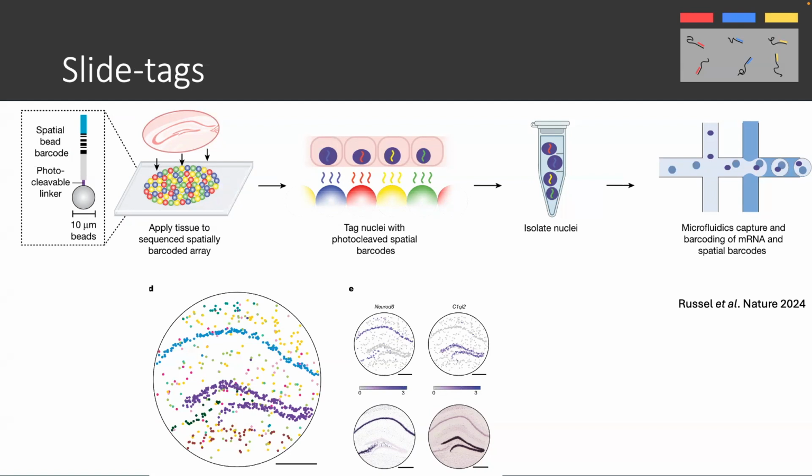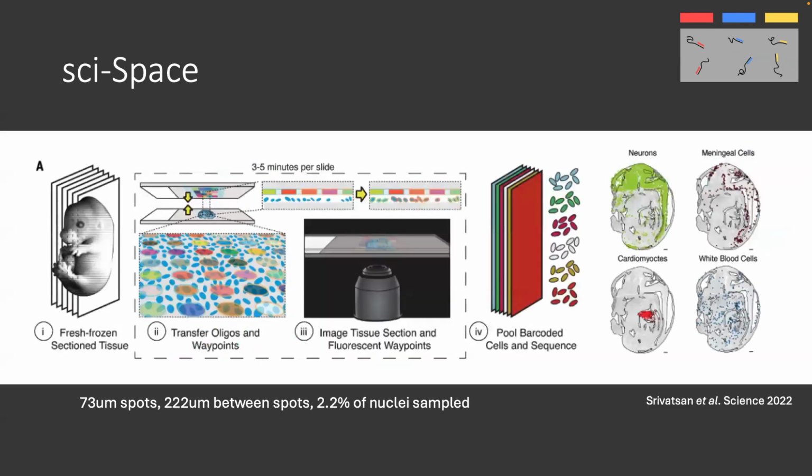So you have the advantages of the existing pipelines of single cell RNA-seq, but now they also give it the spatial coordinates. Of course, important to note is that not every cell that is tagged will also be sequenced. So there is a bit of a loss in your tissue. If you're familiar with this structure, the hippocampus, you might notice that there should be more cells in this layer here. Similar idea here is with a method called SciSpace.